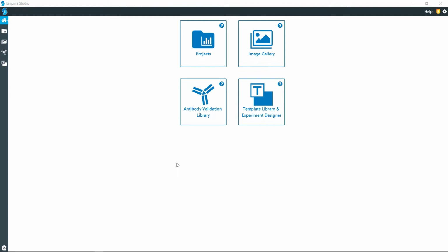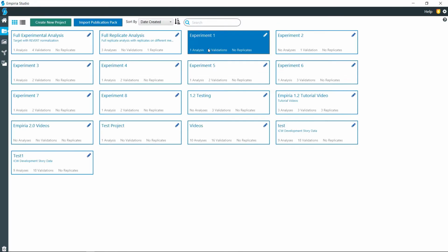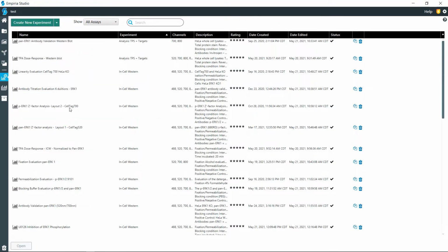In this video, I'll be walking you through the steps of doing antibody titration validation. And this applies to all sets for the plate-based assays, whether it be the In-Cell Western, ELISA, or just target analysis. So I'm going to go ahead and open up one that we already have started.